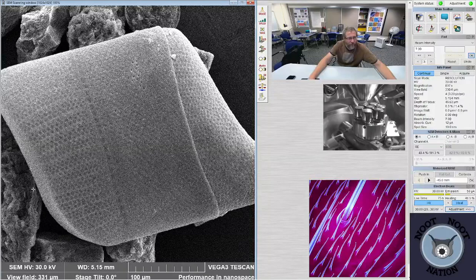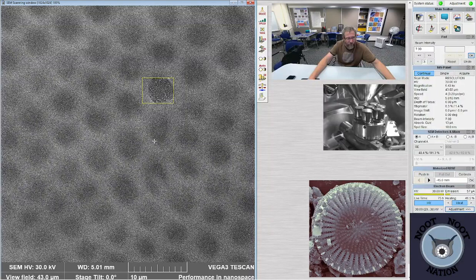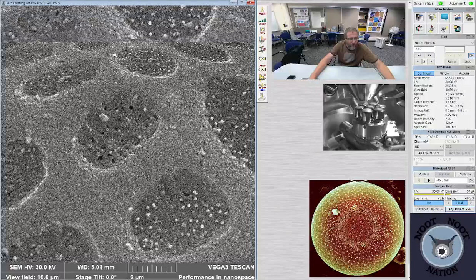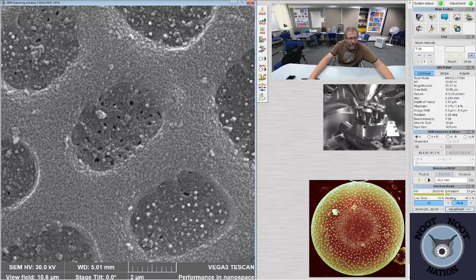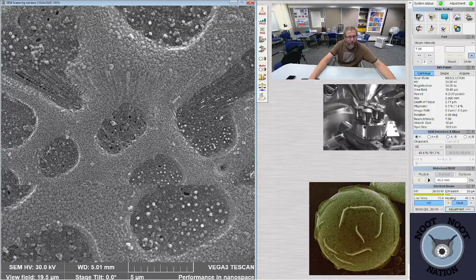On the surface of these, sometimes in these pores, and they're perfectly in focus. I think the pores on these things measured something like 2 microns across. This diatom is really huge. And yeah, so there's a pore. One of the pores on these things are basically in some cases 3 to 4 microns across. And there's some diatoms that, you know, that's their total size. Their total size is like 3 to 4 microns.